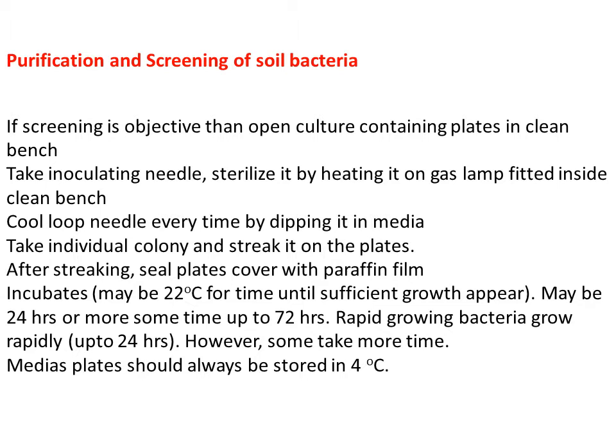Now take individual colonies, for example a pink color, a different shape, a different size. Take individual colonies and streak it on other plates containing media. After streaking, seal the plates. Cover with parafilm.